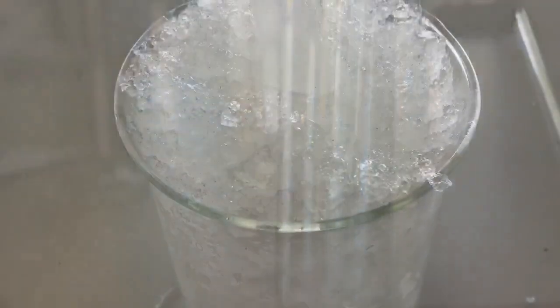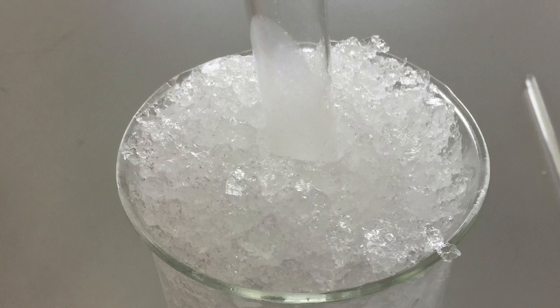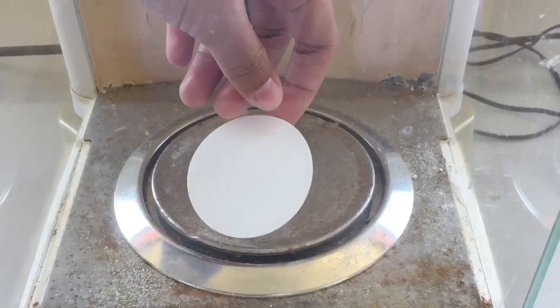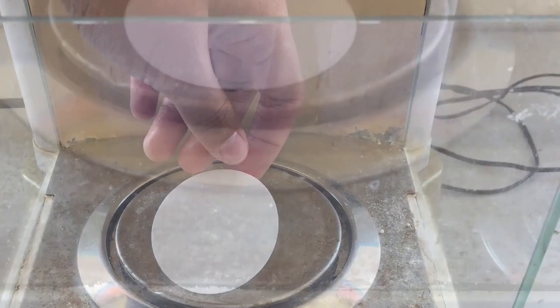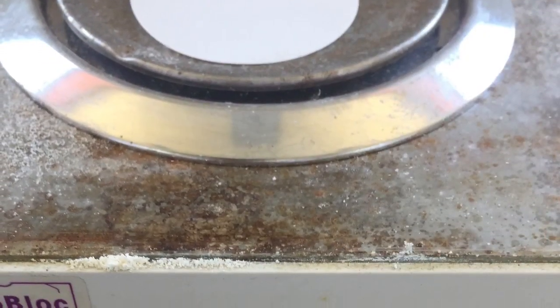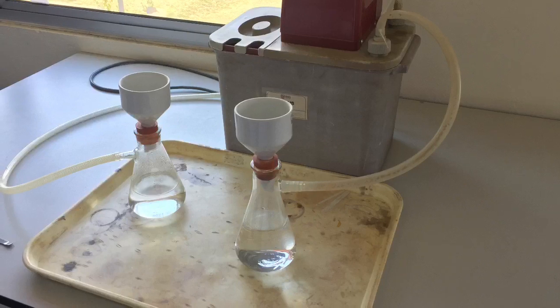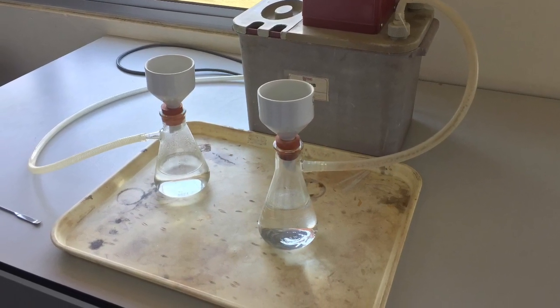After that, the solution was cooled in the beaker that contained ice. The crystal that formed was filtered with a Buchner funnel that is lined with weighed filter paper. After that, the crystal was rinsed with cold distilled water and was dried using an electric pump.